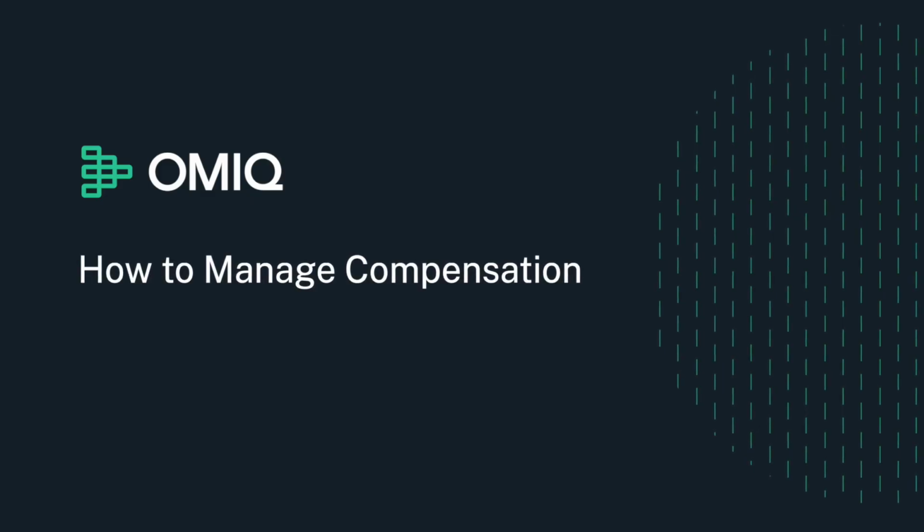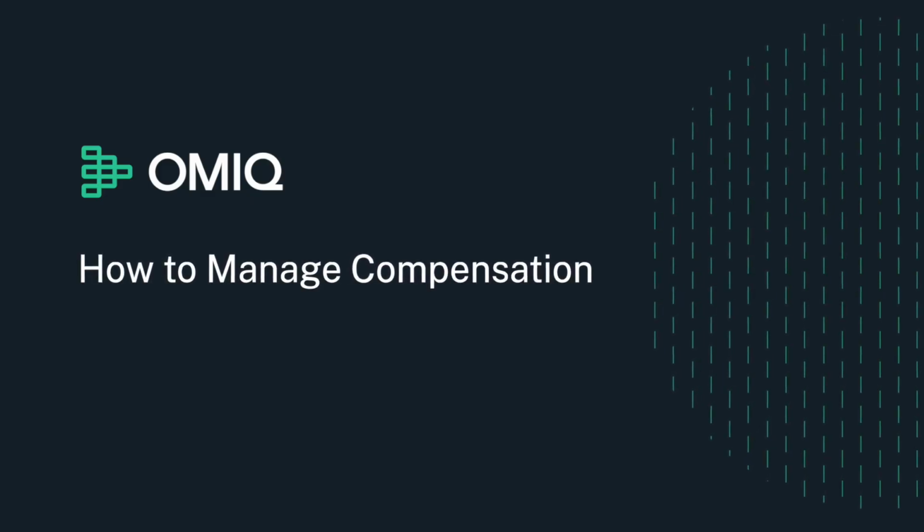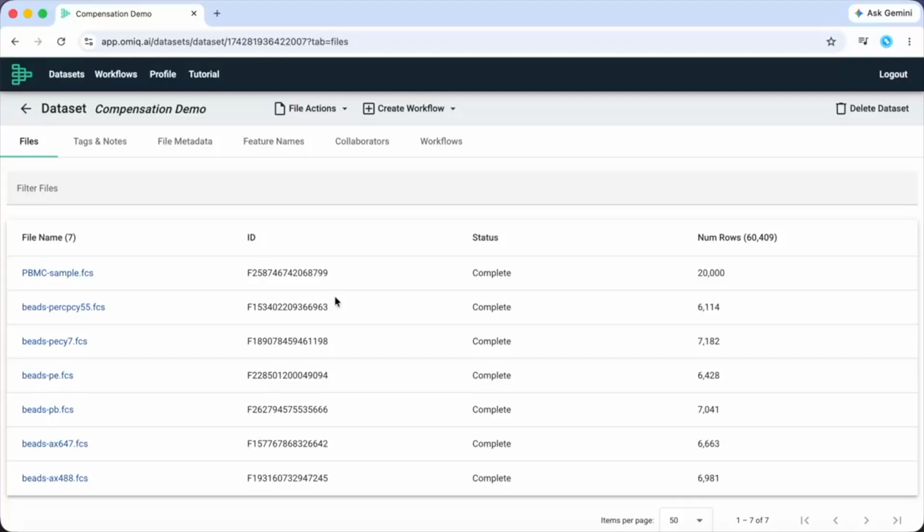Welcome to this video on setting compensation in OMIQ. For this example, I have a dataset of 7 FCS files. To get started, create a new workflow.